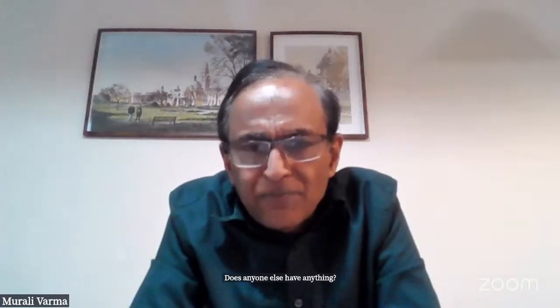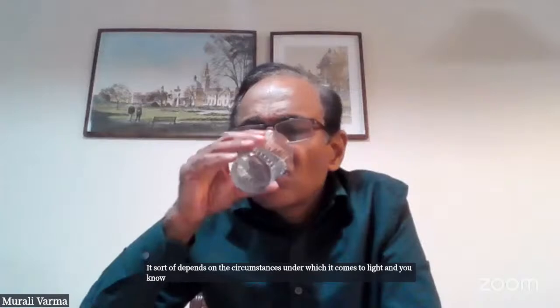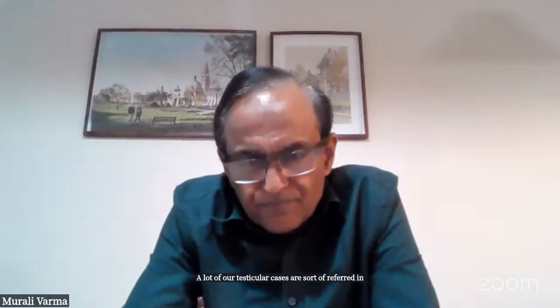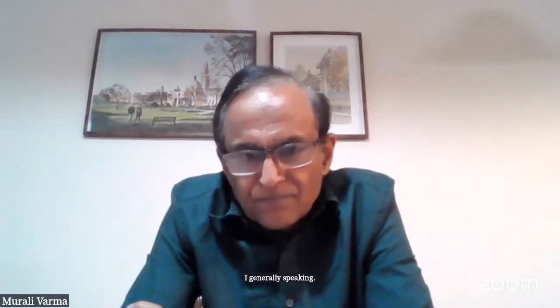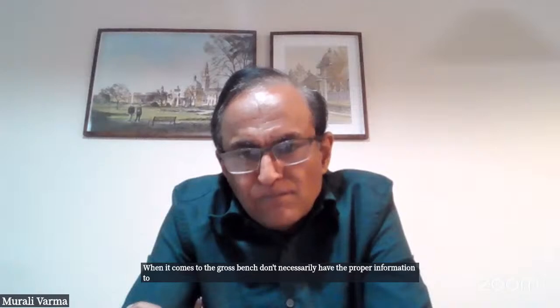Does anyone else have anything? It sort of depends on the circumstances under which it comes to light. A lot of our testicular cases are referred in, and at the time they get here, you have relatively limited clinical information. So generally speaking, at the gross bench, I don't necessarily have the proper information to know that it is going to be a regressed case.